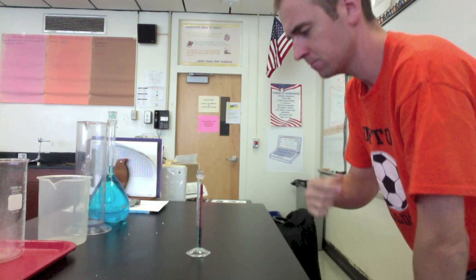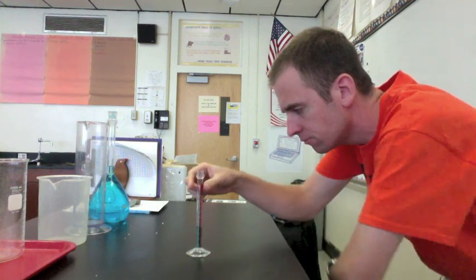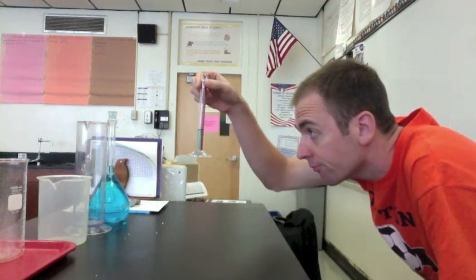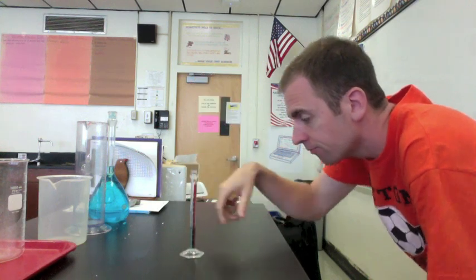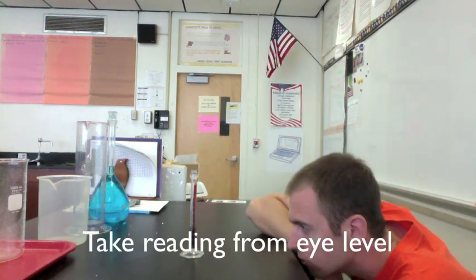When using a graduated cylinder to measure volume, do not look at an angle — you'll get an inaccurate reading. You want to be eye level, but don't lift the graduated cylinder off the table or you'll get a poor reading. Keep it on a level surface, and get down eye level with the graduated cylinder.